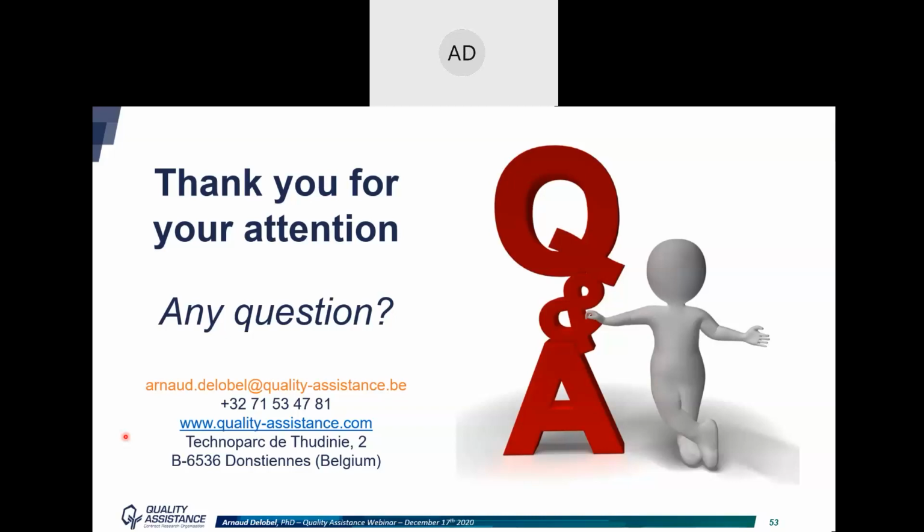But that's what I would do. First, optimize your ion exchange chromatography method to get a similar resolution to the icIEF. Then collect your different variants after the ion exchange chromatography and re-inject them by icIEF to compare the retention times, identify your variants and do the correlation between the two techniques.